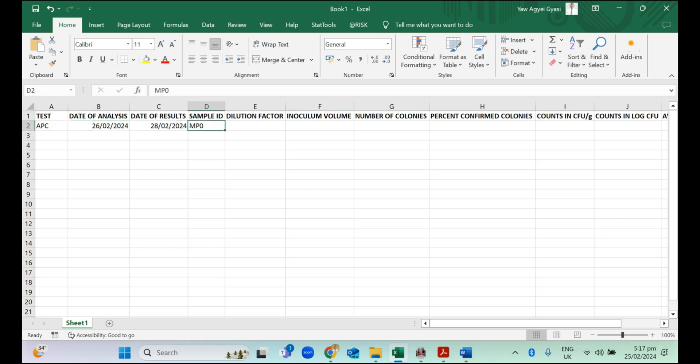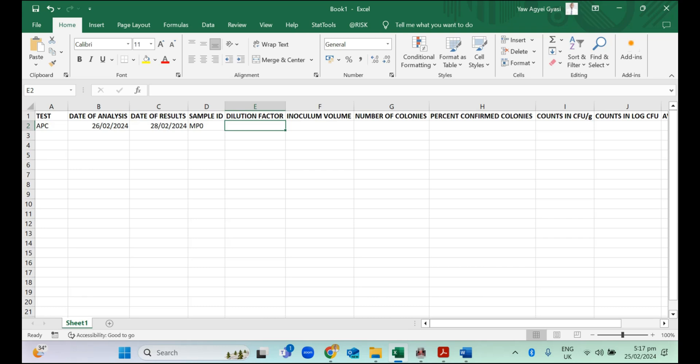Sample code is MPO, the dilution factor. That's the dilution factor that gives us counts for the work we are doing. For example, you may have had several dilutions. Your first dilution may have given you more than 300 colonies, that's too numerous to count. And your subsequent dilution, that's dilution number two, giving you some counts. Whatever dilution factor that gives you counts, you just have to input it.